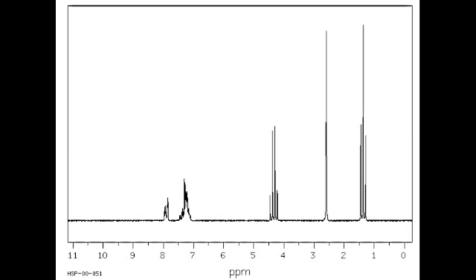Well, if you remember, carbon B from the molecule we were just looking at, that's at 4.25 because it's next to an O, and an oxygen is electronegative and therefore will draw electron density away from carbon B, meaning it'll be a bit deshielded, therefore it'll appear a bit downfield.